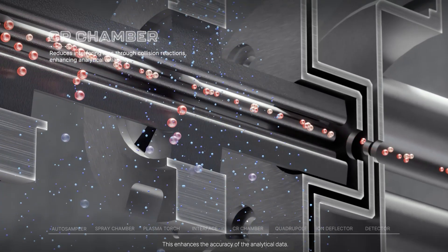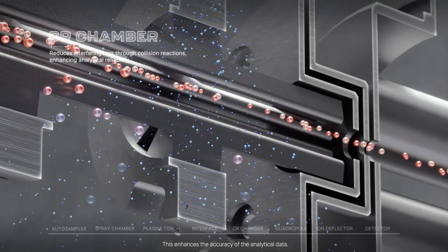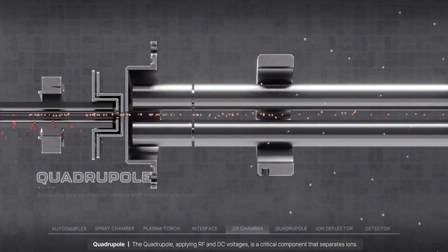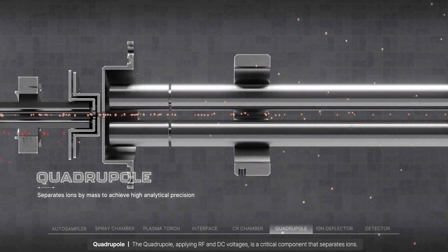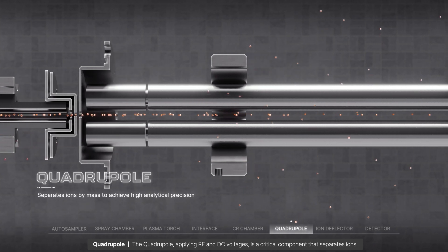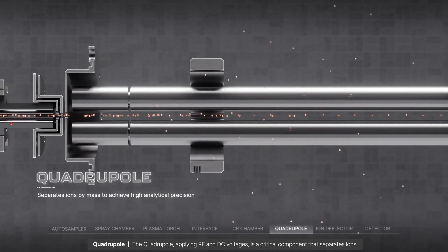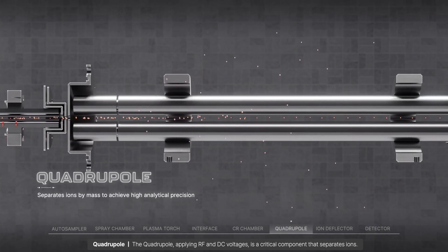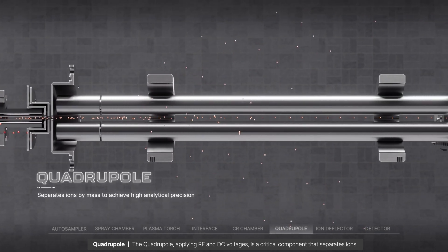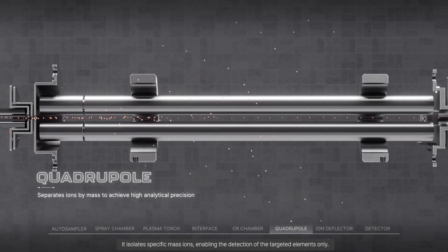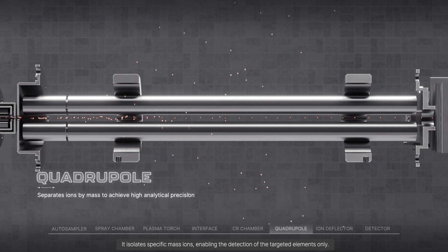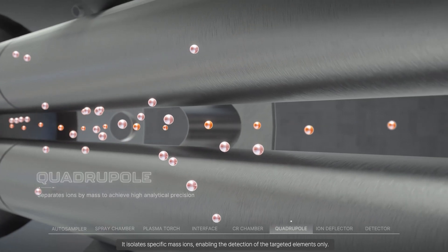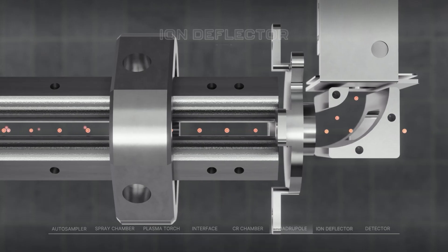This enhances the accuracy of the analytical data. The quadrupole, applying RF and DC voltages, is a critical component that separates ions. It isolates specific mass ions, enabling the detection of the targeted elements only.